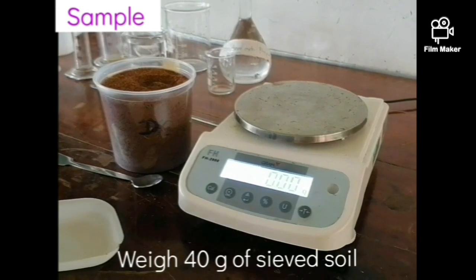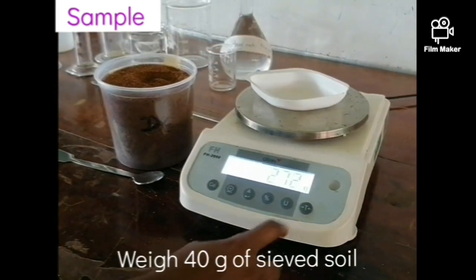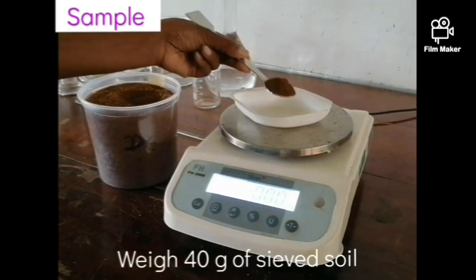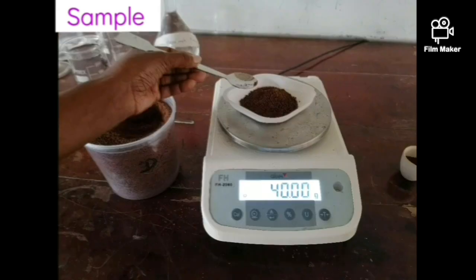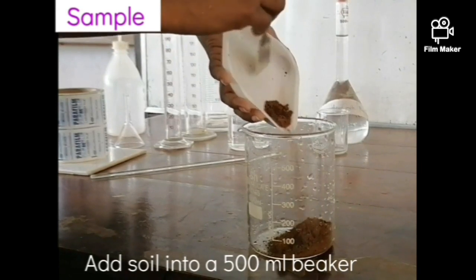As the initial step, weigh out 40 grams of air dried soil which was already passed through a 2 millimeter sieve and add it into a 500 milliliter beaker.